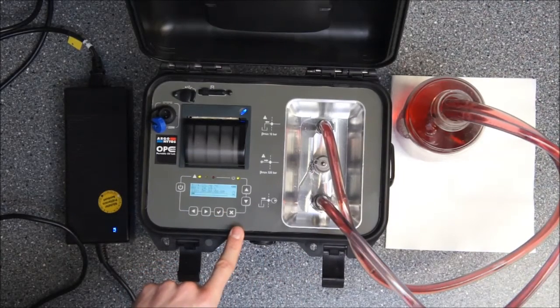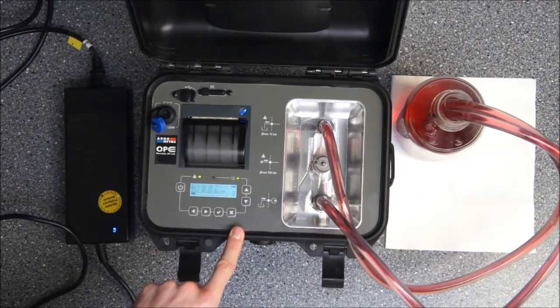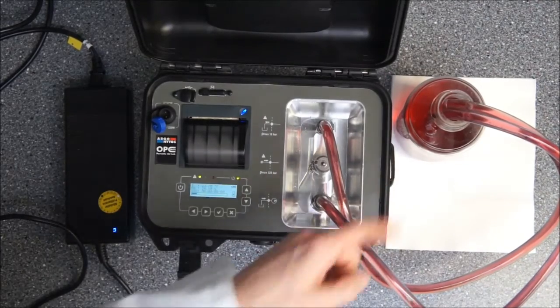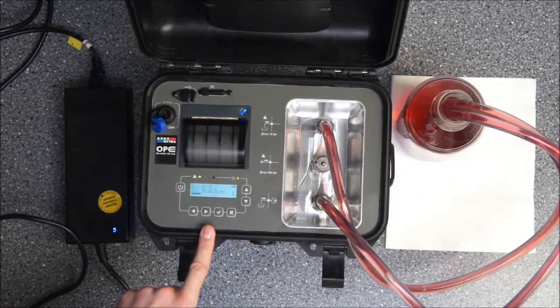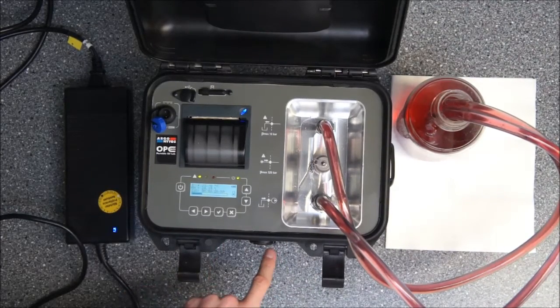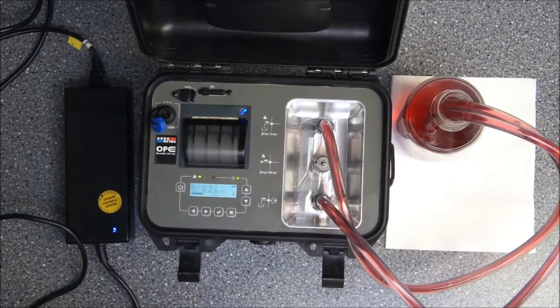You see that the oil is just sucked from the reservoir and also via the return line is pumped back. Therefore the oil sample is brought to the internal measurement cell and is analyzed.